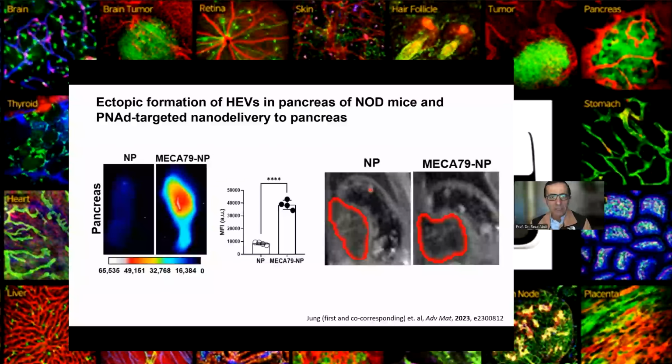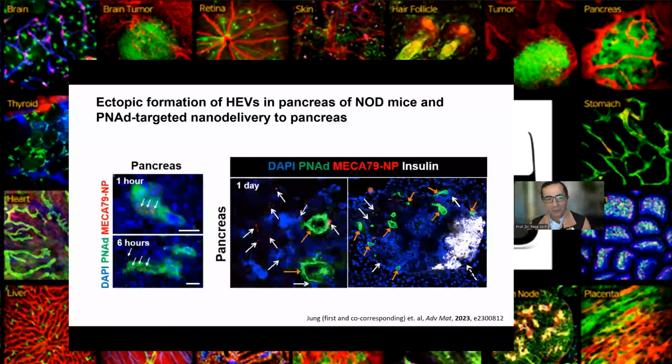So this is the image that we did with the MRI to figure out whether particles home to the pancreas, but I think this was so complicated and so labor intensive to do MRI type things. But again, this is way more costly. I mean, the cost of putting the MRI machine, etc., was way more. So I think it would be more attractive to do a more live imaging the way you do it, especially if you can image the pancreas over time.